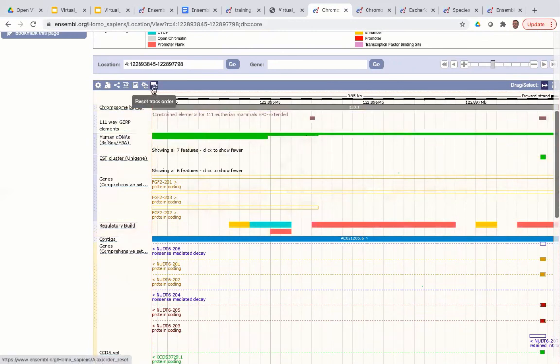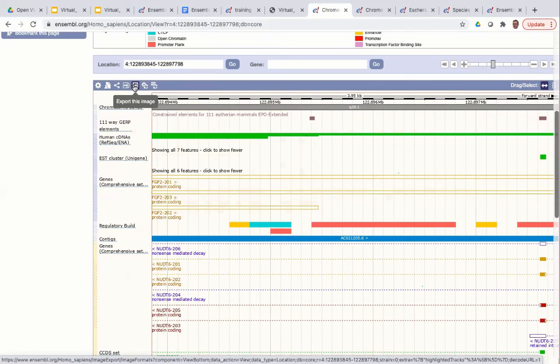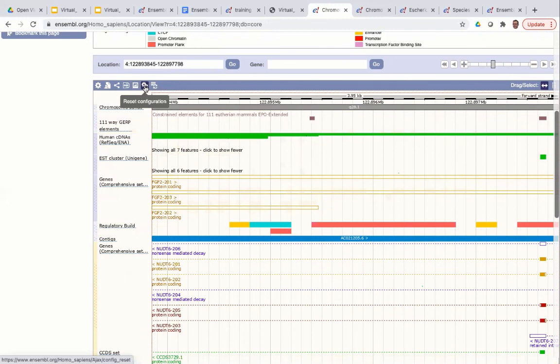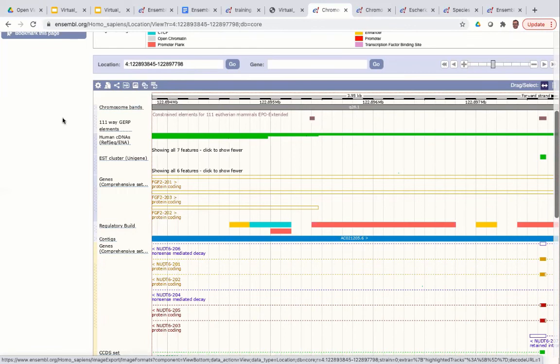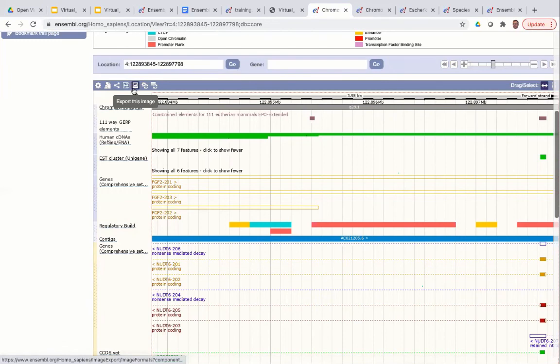On the left-hand side you can see different options: you can export the image for printing or publishing, reset the configuration back to the default view using the cog with the circular arrow, or reset the track order. These options in the top left let you reset both track order and track configuration, and you can export images using the portrait picture icon.